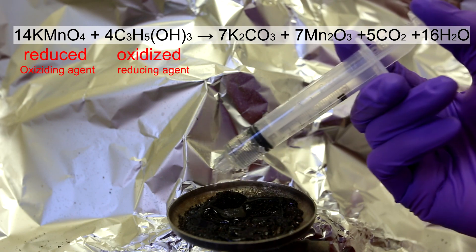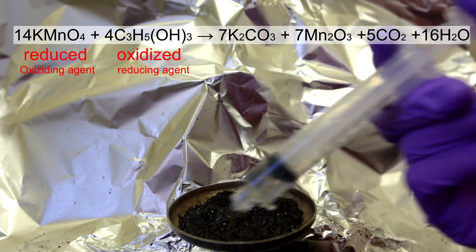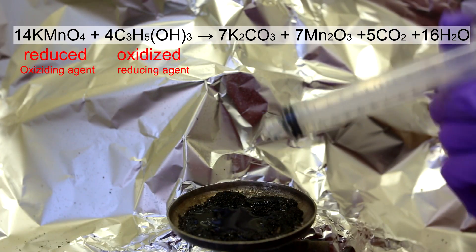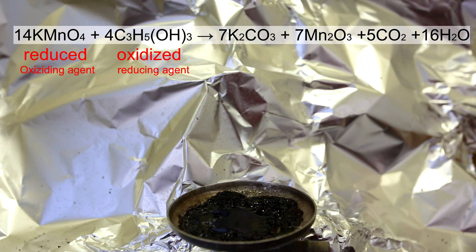The overall reaction is shown above. The potassium permanganate reacts with the glycerin to form potassium carbonate, manganese 3 oxide, carbon dioxide and water.